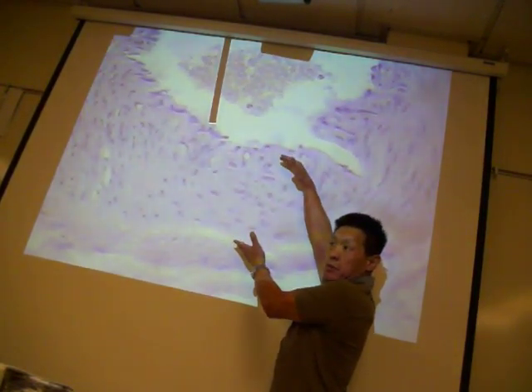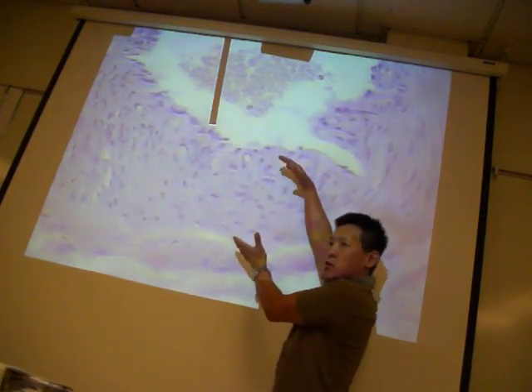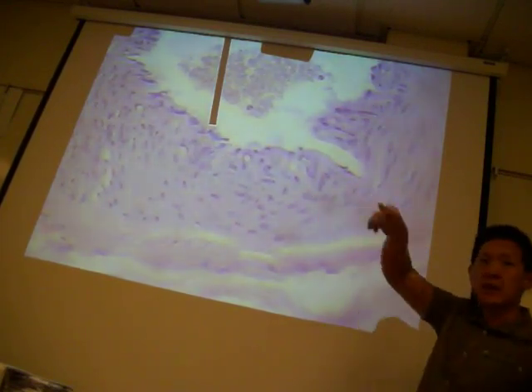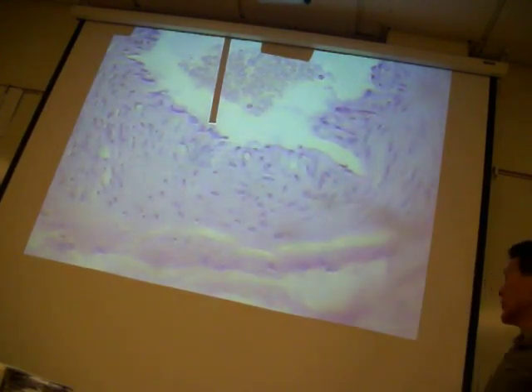We're not going to see that big thick muscle layer on there. So this is a larger artery. But one of the things here, you notice how it's pretty wavy looking right here in this view? So in an artery, what you'll find in the tunica interna is some elastic fibers in there. Okay? And what you're going to see is, because it's going to stretch, you want that rebound.